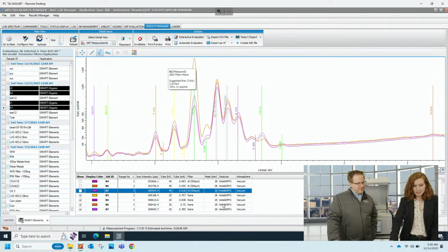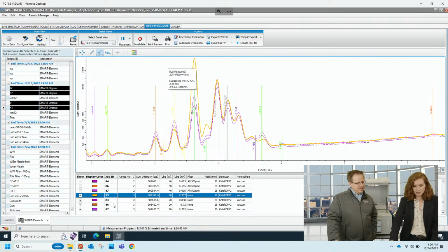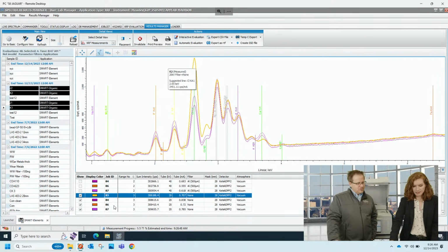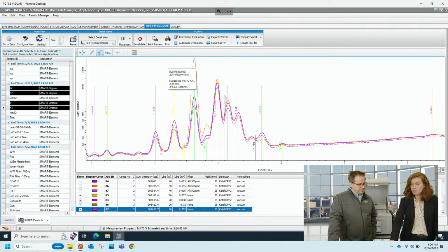It's K1 and K2. And what we can see is that it overlaps totally, right? There's K1, I measured everything twice. They are totally overlapping. So exactly the same, every cookie time, the same thing. And the other thing is, the ones that I made, they are a little different. Maybe the difference is the chocolate chip, who knows? One thing that we can see though, is that the industrial one has more salt in it, right? More sodium. And my cookies do not have that much sodium.